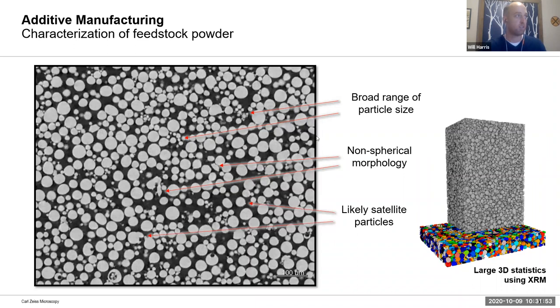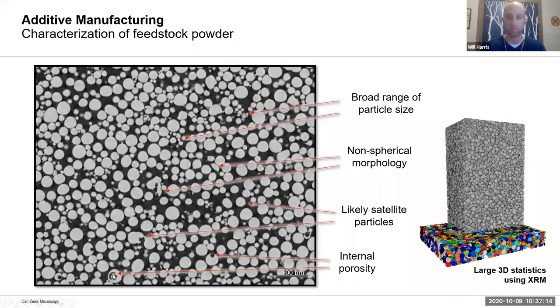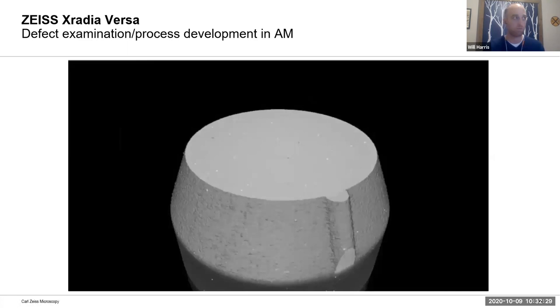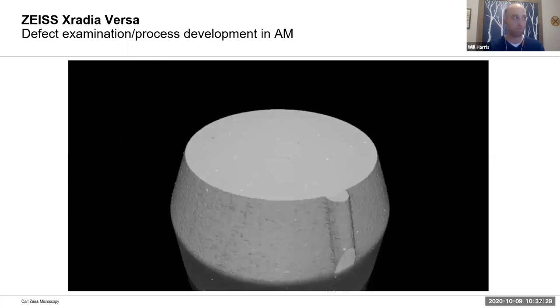One of the things we can do when interrogating powders in 3D is look at different types of features that would impact performance in the printing process — things like the range of particle sizes, non-spherical geometry in 3D, so-called satellite particles that are clinging onto bigger ones, and most interestingly internal porosity: what looks like a big particle but is actually a void inside. Once you use this to print a 3D structure, you want to evaluate the quality of that print for defects during the build process.